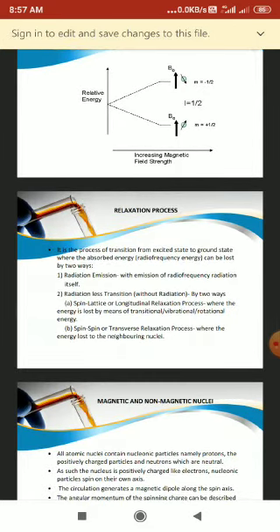The spinning nucleus, meaning the nucleus of the hydrogen atom, the proton, behaves as a teeny spinning bar magnet, and it does so because it possesses both electric charge and mechanical spin. Any charged body will generate a magnetic field, and the nucleus of hydrogen is no exception.